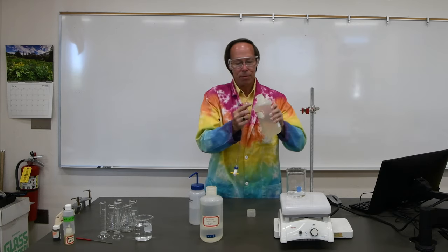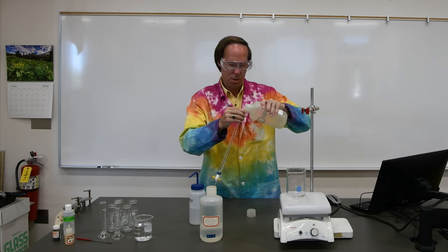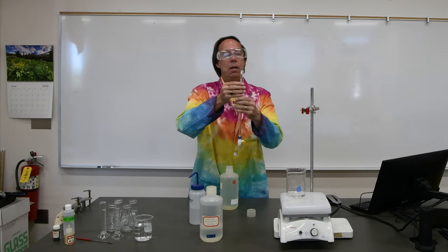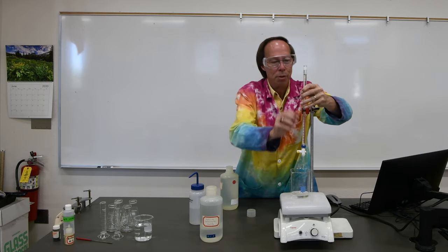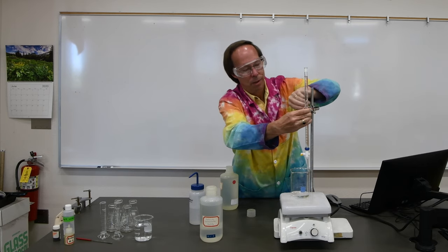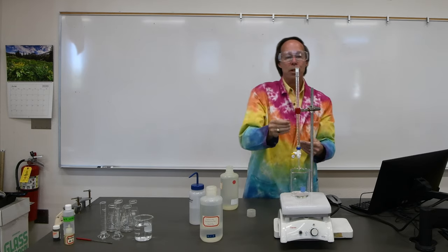Now we can go ahead and fill the burette. So we'll go ahead and pour in EDTA to get ready to do our titration. Now it doesn't matter where you begin the titration. So I filled it up between the 1 and 2 milliliter mark here. I'm going to go ahead and clamp it back in.